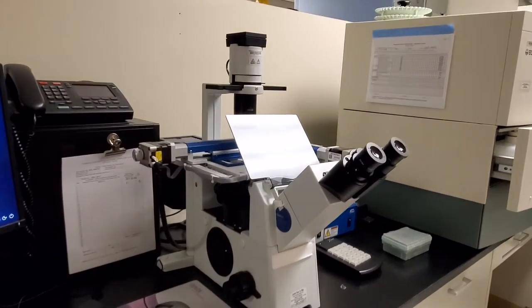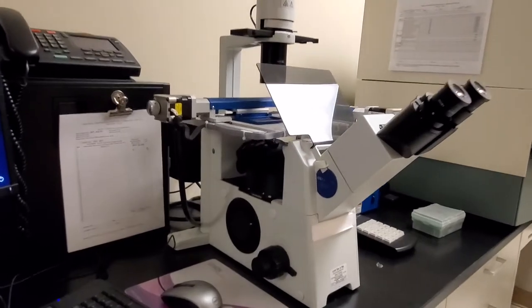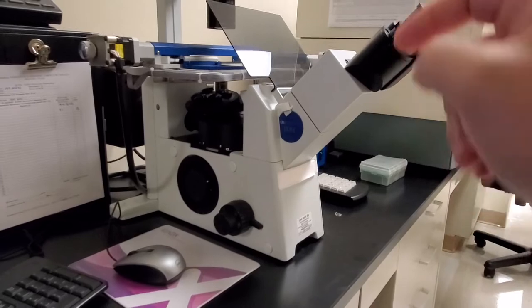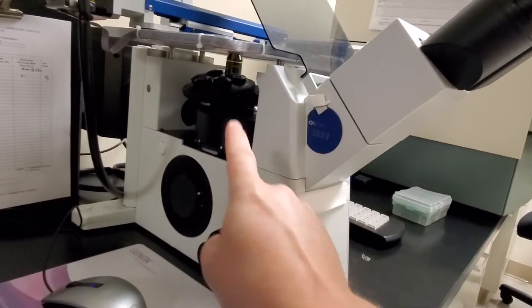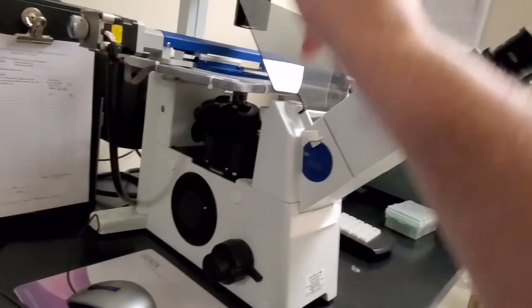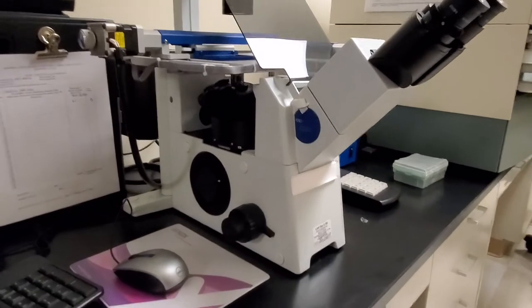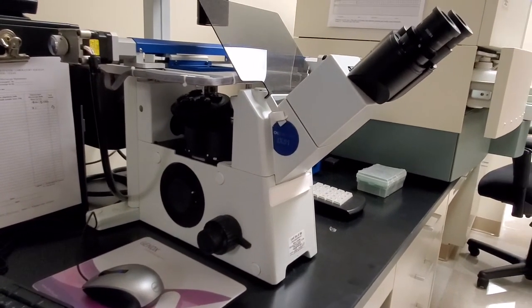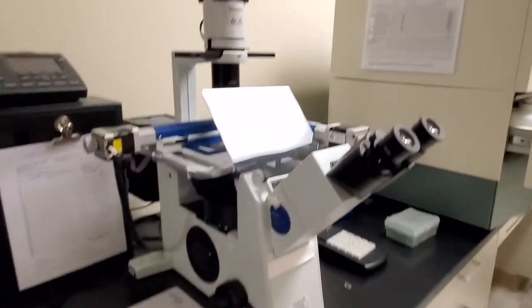Right, here we have a special version of a microscope. This one here you will not find very often. It's the Olympus IX51. It's an inverted microscope. You can tell this because you're looking down here and your objective is right there instead of being up on the top. This type of microscope is not just a phase contrast microscope, but it also does bright field and fluorescence.